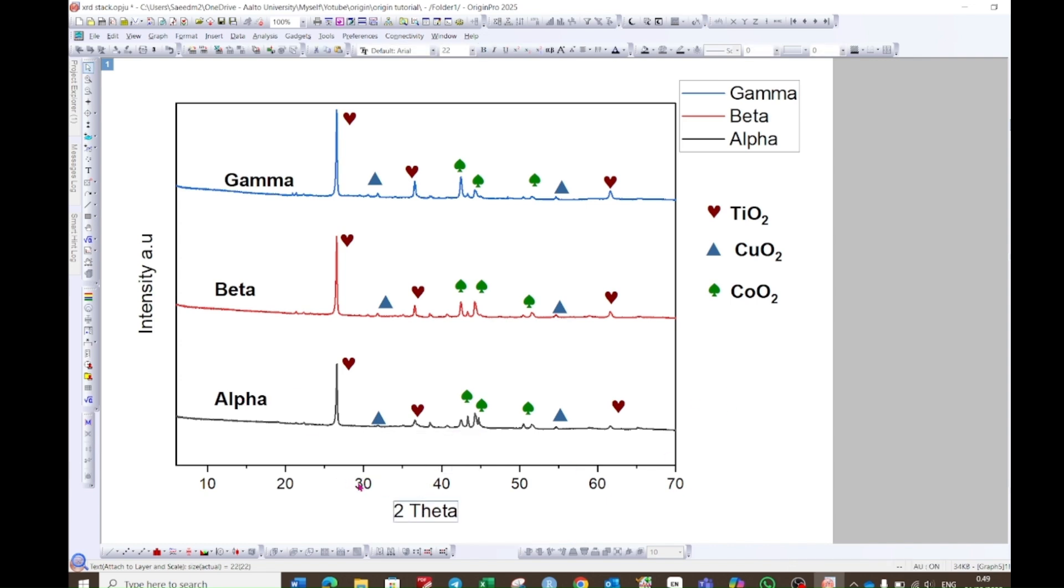Now you can select the y-axis and make it bold. Similarly the x-axis and also make it bold. Similarly the y-axis.